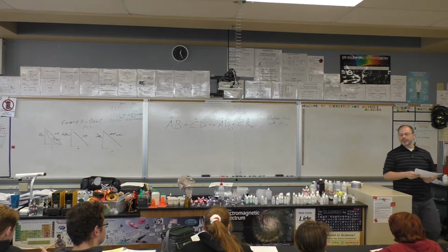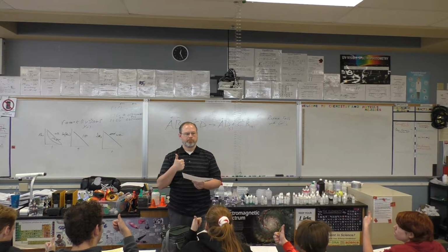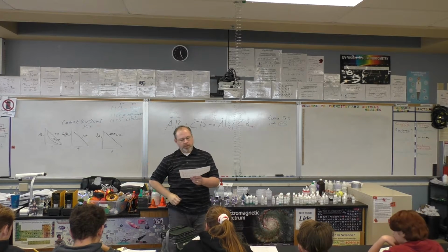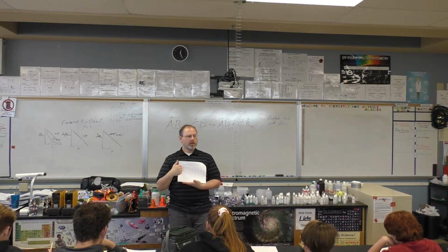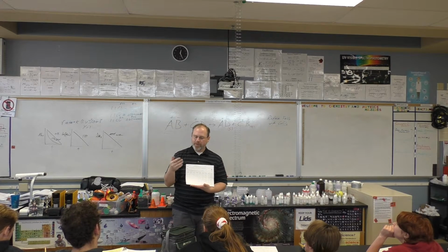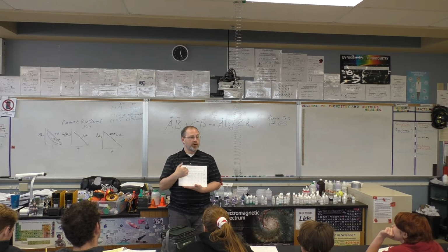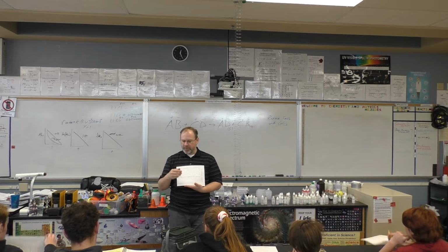Okay, with my instructions so far, does this make sense so far? Give me a thumbs up if you're with me. Wave your hand around if you have questions. Okay, so you're going to have this filled out with yeses and nos. Not all of the combinations will make precipitates. For solubility rules that you can learn if you want to take AP, some compounds will stay aqueous. Some will form precipitates. If you flip your lab over, you're going to see two more charts.